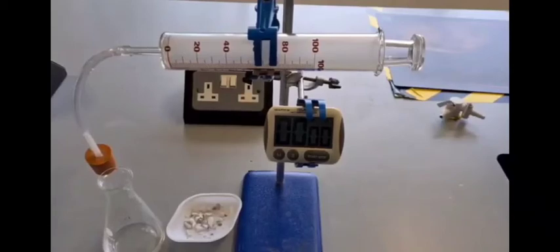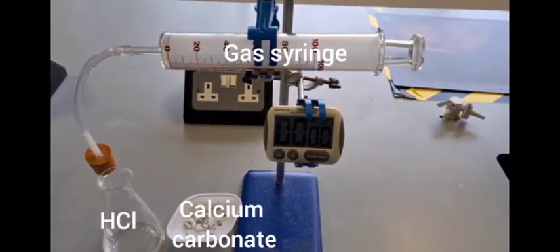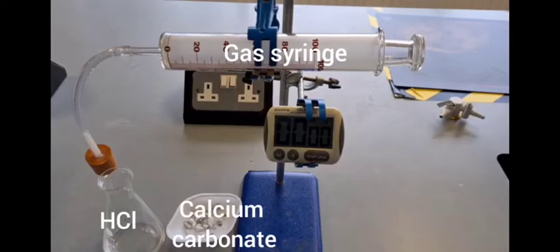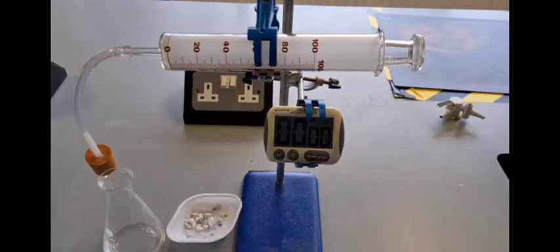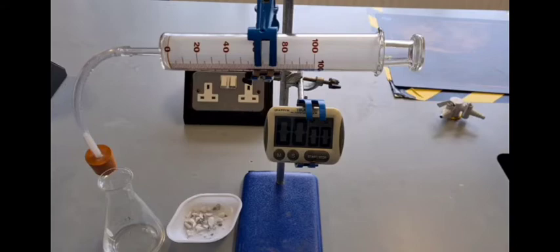We're going to look at the reaction between calcium carbonate and hydrochloric acid. We're going to try and measure the volume of carbon dioxide gas produced at 10 second intervals.